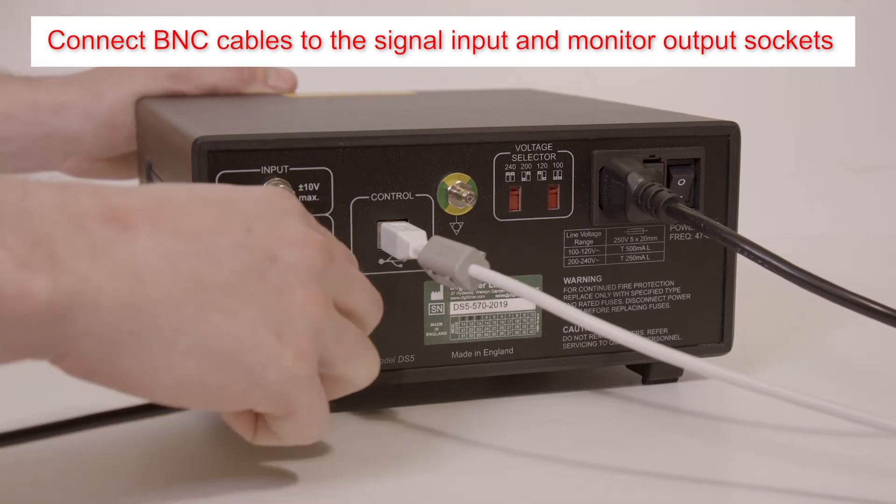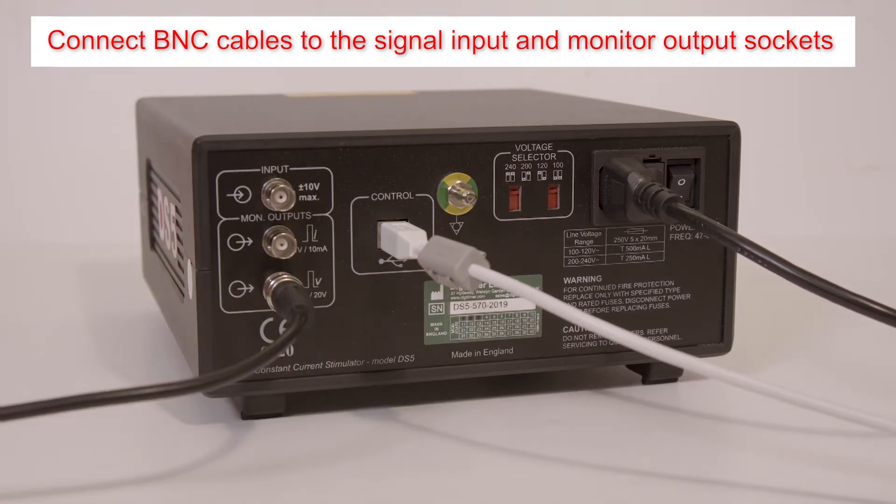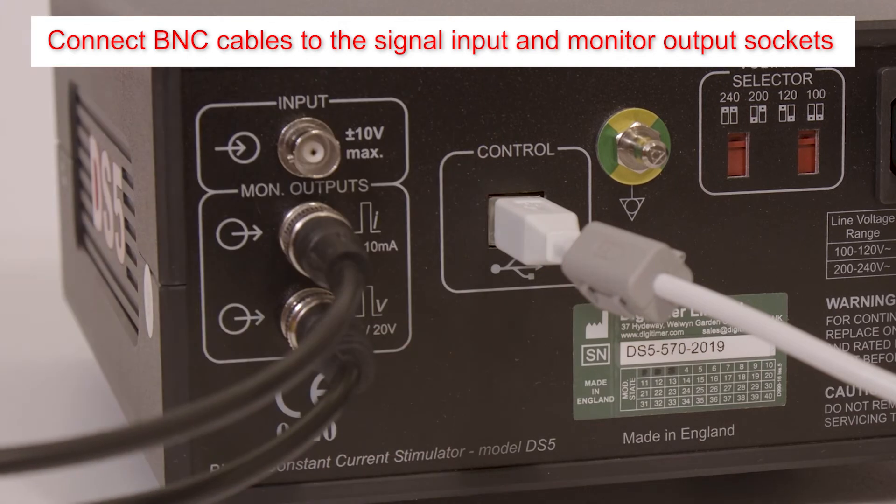Next, connect a BNC cable to the signal input socket and optionally to the current and voltage monitor outputs.